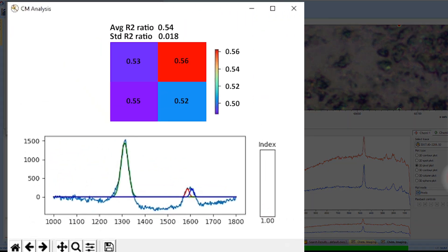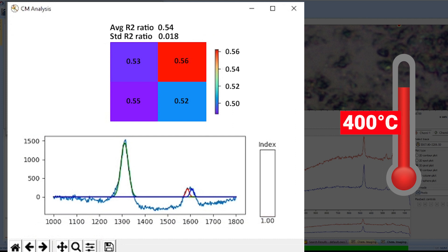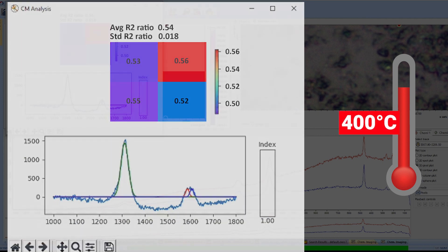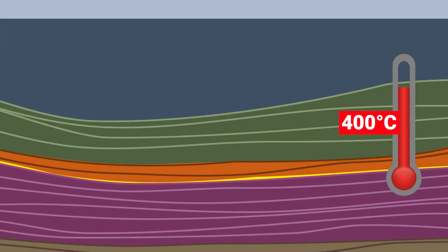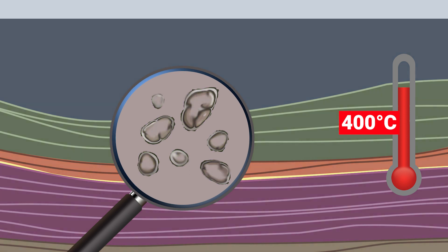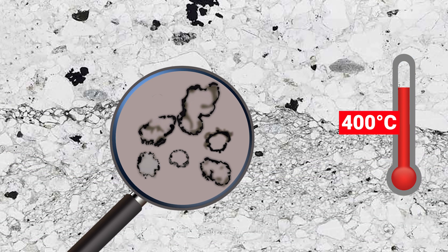In this case, the temperature calculated gives a peak temperature of circa 400 degrees Celsius. This high overprint most probably caused chemical changes in the microbial remains that make it difficult for researchers to receive more information about the origin of the organic matter.